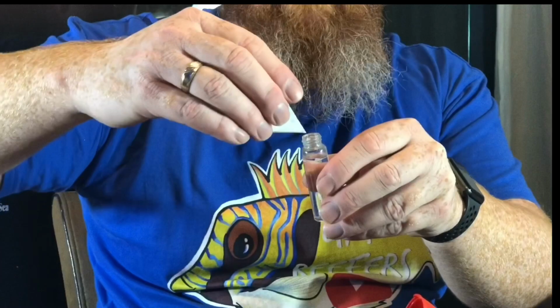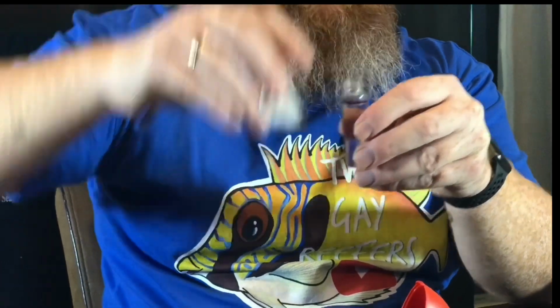You get your reagent, pour that in. Once again, give it a shake for about 15 seconds. Make sure everything's mixed and make sure there's no major bubbles. Pop it in and wait. Once again, this one is nice and quick. It takes about 30 seconds or so for it to read, and it comes up at 402. And if I know anything, I think our calcium has dropped a little bit.